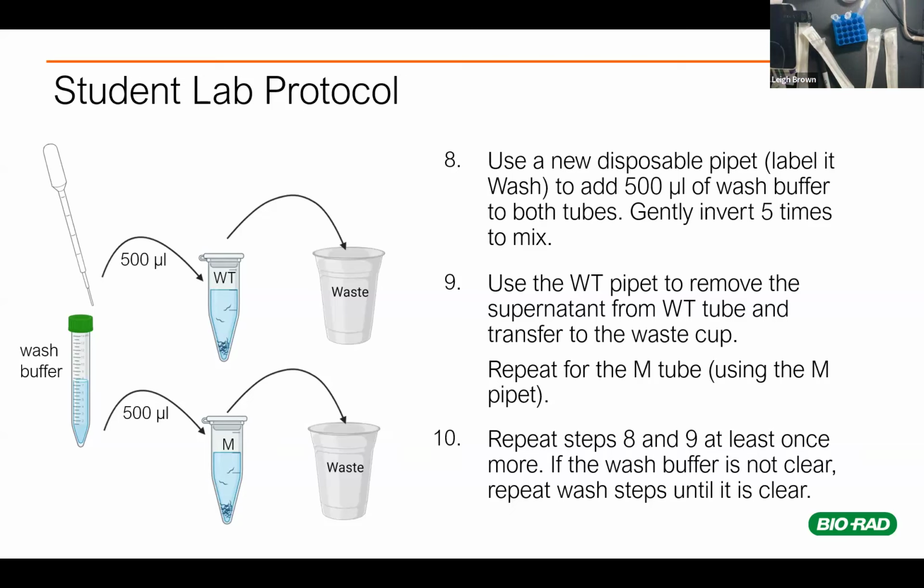That was a good tip. Mary said that she has her students save the washes, so they could absolutely put them into a separate tube in case they accidentally create a worm pool. I like the worm pool.